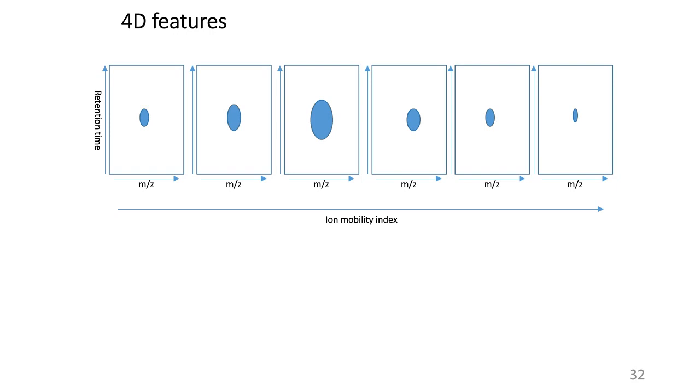It's actually quite a continuous process that we're going to find here. And then simple assembly or clustering algorithms will be able to show you what this three-dimensional surface would be, you can imagine, kind of the surrounding surface that is embedding this four-dimensional feature that we recovered through this assembly process between the slices. So then we have the four-dimensional features.